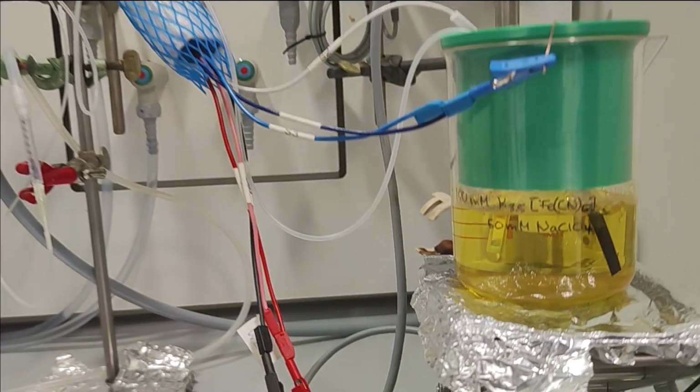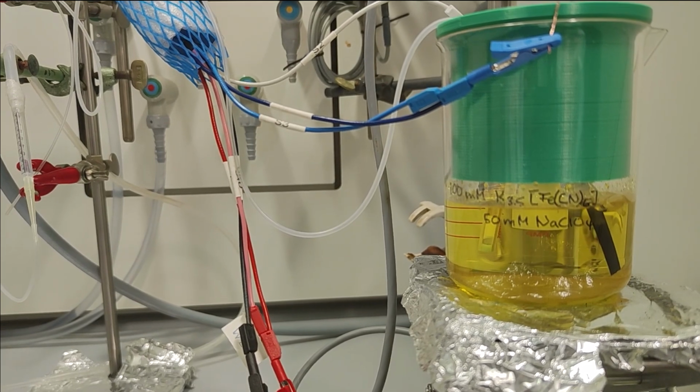Hello everybody, my name is Kathleen. I'm a postdoc at the Shape-Dependent Electrochemistry group. Today I want to show you something more about linear semi-infinite diffusion. Therefore, we prepared a familiar experiment in form of a cyclic voltammogram. The experimental setup looks like the following.